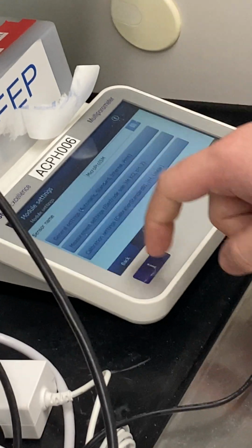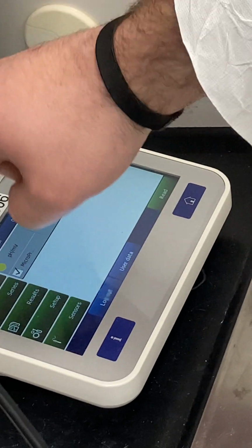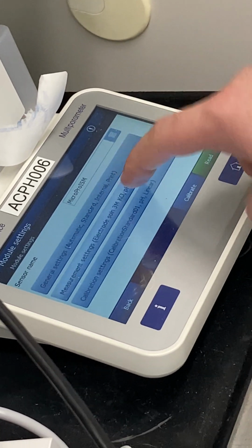I wouldn't change any of it. Here we can, this is the home screen. Okay. There's spots for 3 modules. There's only 1 module in here though, so it's this. So I wouldn't mess with any of those general settings.